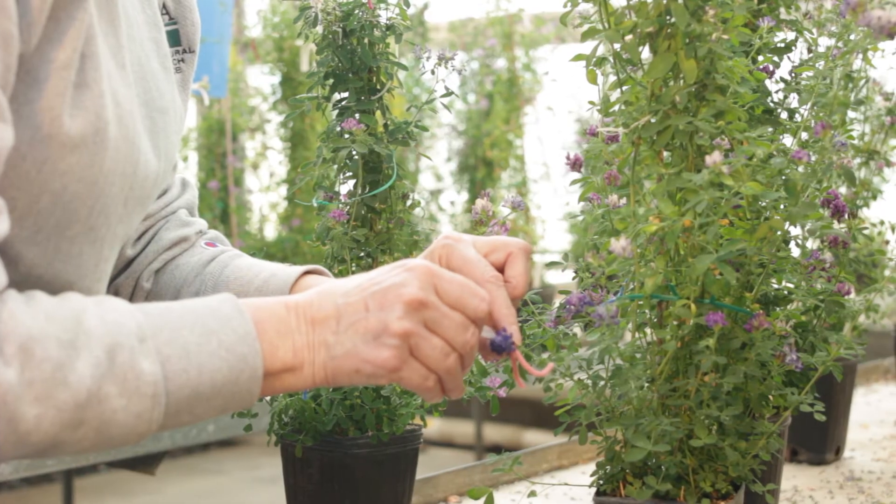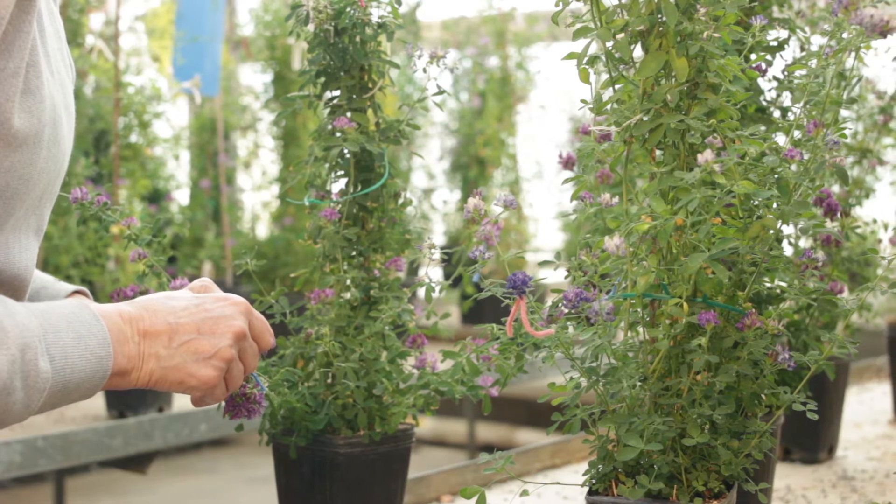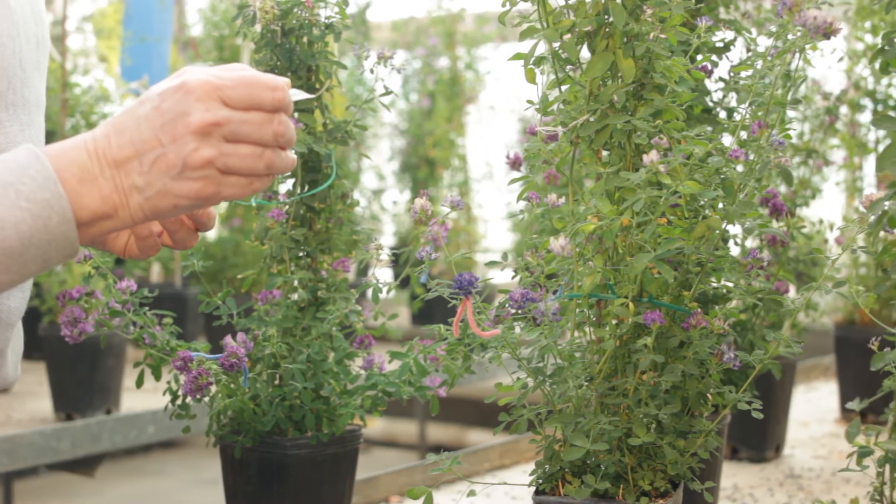If you desire to make a cross between two specific plants, just pollinate alternately from one plant to the other. Note that some self-pollination will occur using this method.